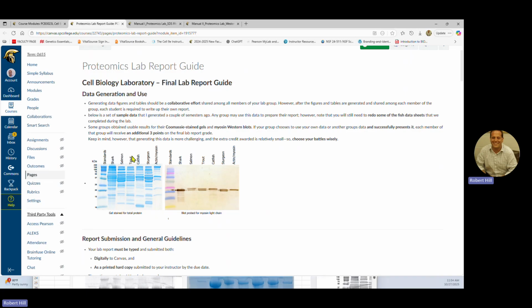We used 5 fish samples, but there was some difference in the fish samples. So if you're going to use this data, you have to go back, I think, and fix one of the fish samples. I don't think we did sturgeon this semester. I couldn't get any sturgeon, so you have to print off another fish data sheet and fill that out for the sturgeon. I think these are all the same otherwise.